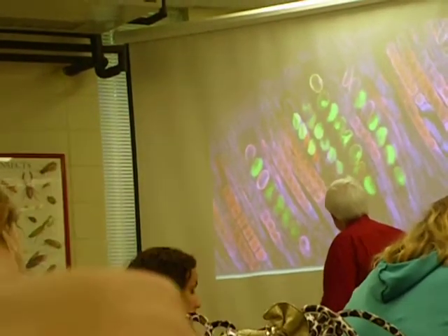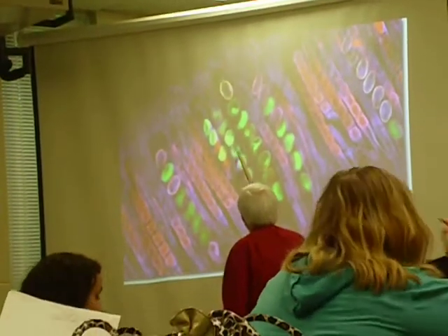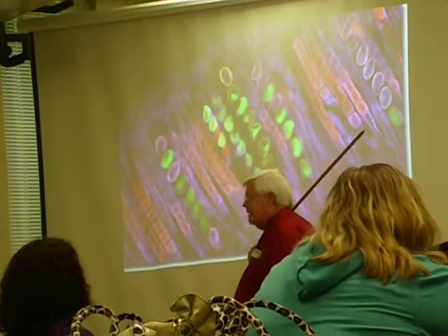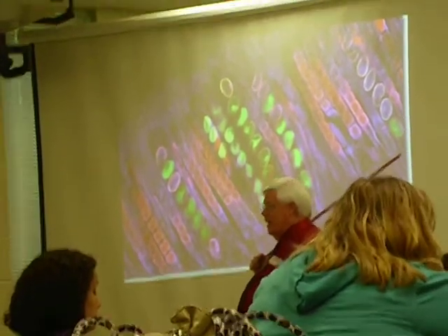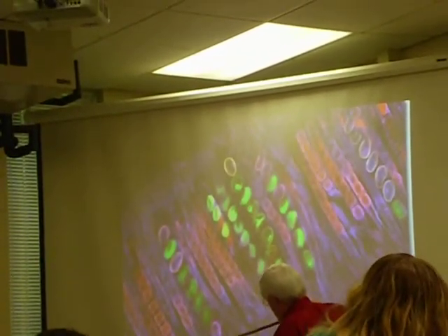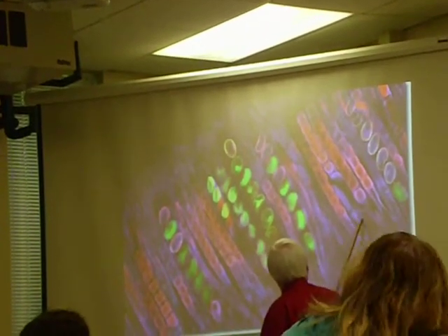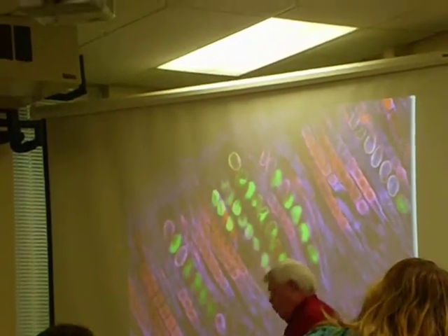What is this sac-like structure that they're found in? Asci, or ascus. Where this structure narrows down and becomes filamentous. Ascospore.